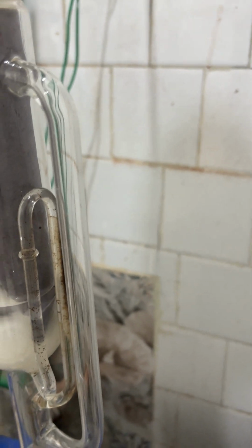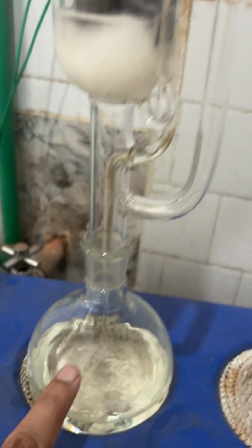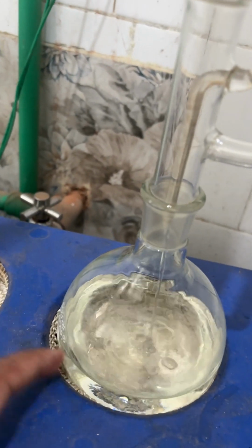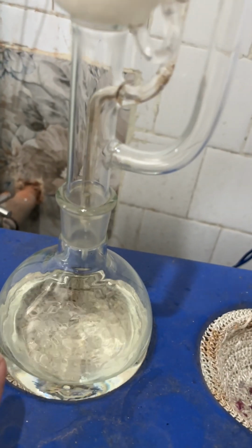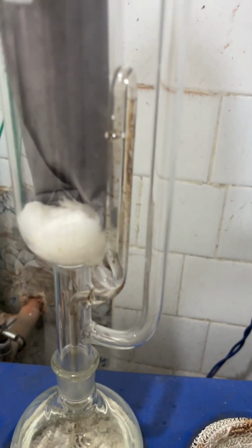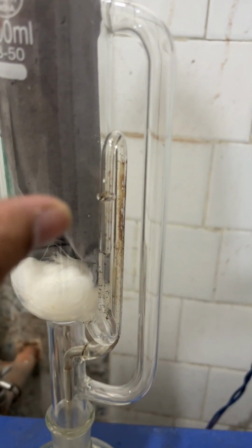See, so you see it's coming down, all the liquid is going inside. Okay, so that's why we keep the volume of this larger than this. If this is 200, this should be 500. We should fill this once, it will go reflux, and then again around 75% will fill this, so it refluxes and it all went down.